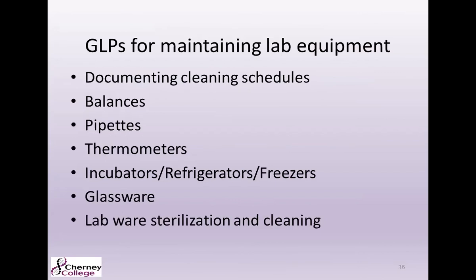So far, we've talked about GLPs and quality assurance for sample setup, talked about media QC and inventory, et cetera. Let's talk a little bit about maintaining lab equipment. You're going to want to make sure that you document your cleaning schedules for any lab equipment, your balances, your pipettes, your thermometers, incubators, fridges, freezers, glassware. We're also going to go over a little bit of labware sterilization and cleaning.